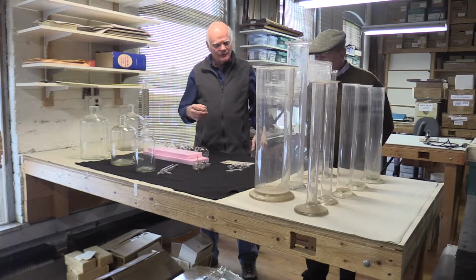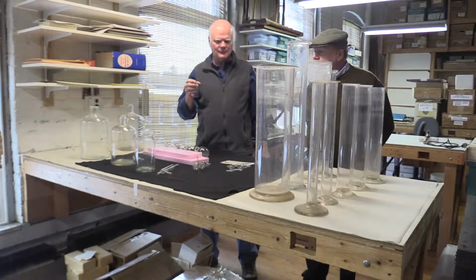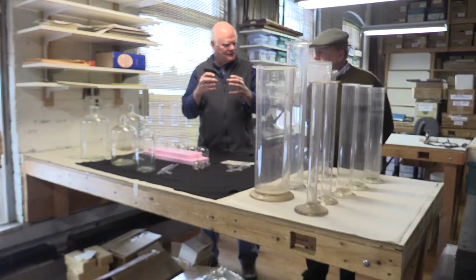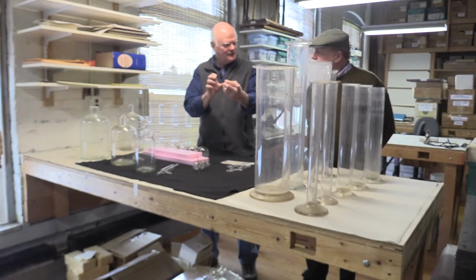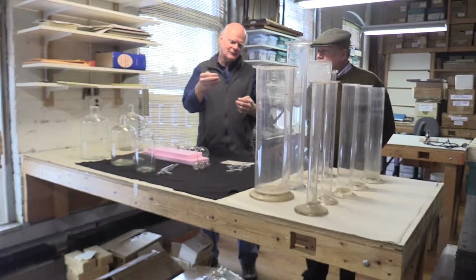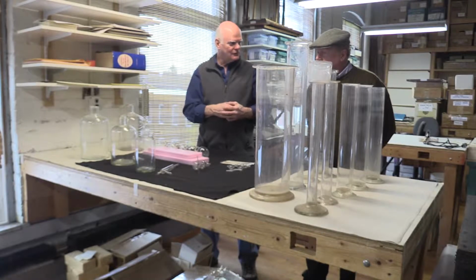So in 1893, some Germans, I think it was Schott, I can't remember who did it, in Germany developed borosilicate glass, which has a much lower coefficient of expansion. So when you hit it with heat, it doesn't expand as much as regular glass. Regular glass breaks because if glass is thick, you hit it with heat on the outside and that expands, but the inside hasn't heated up, so it doesn't expand. So it shatters by torque in the glass. You can make it heat through more quickly by making it thinner. But then all of a sudden, borosilicate glass shows up in the 1890s, and you can make it thick, and it doesn't shatter with changes in temperature.